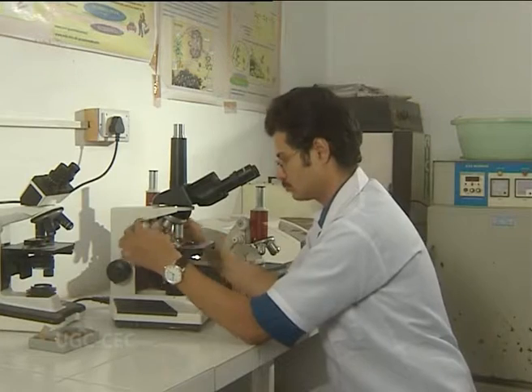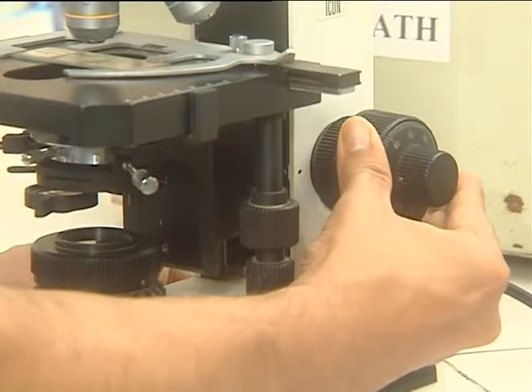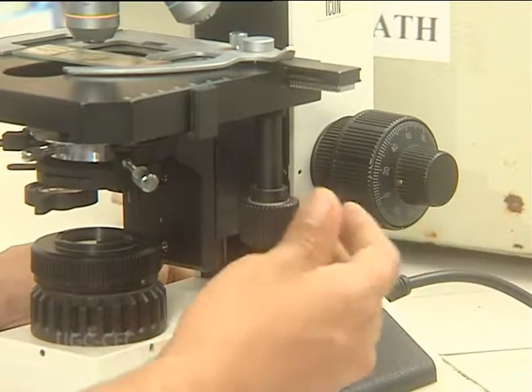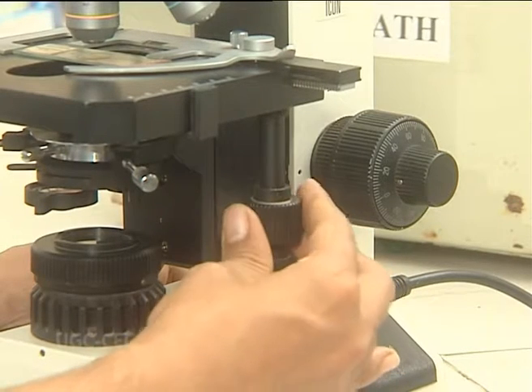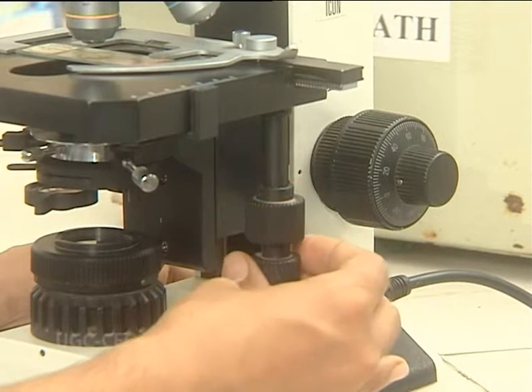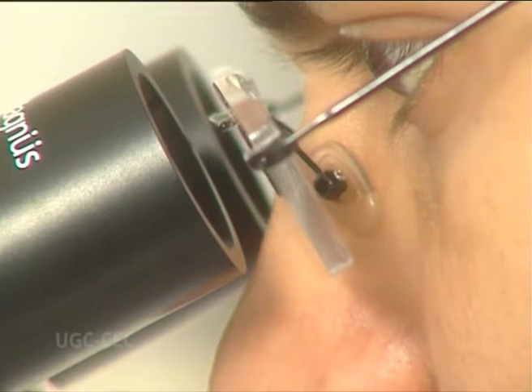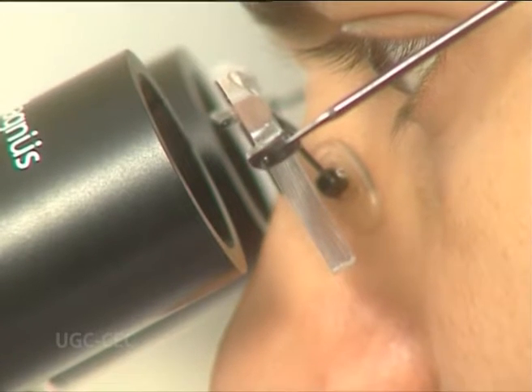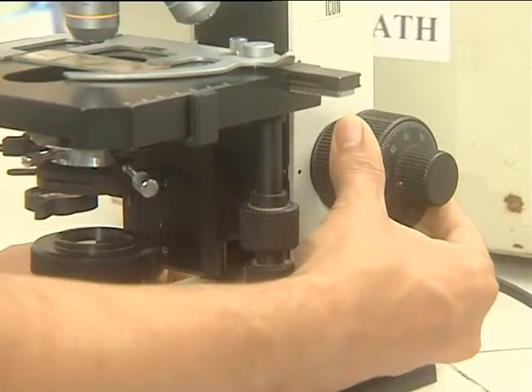Rotate the nose piece to the 10x objective and raise the stage to its maximum. Move the stage with the adjustment knob to bring the desired section of the slide into the field of view. Focus the specimen under the 10x objective using the coarse focusing knob and lowering the stage. Make sure the condenser is almost at its top position.